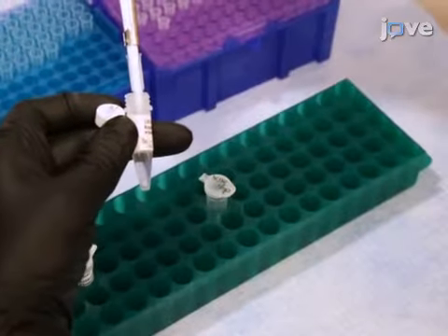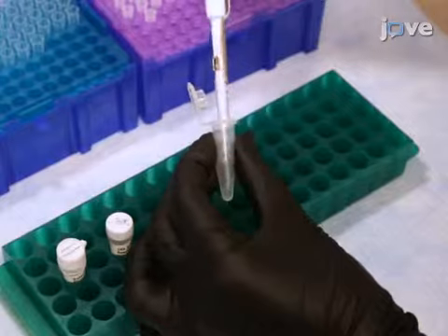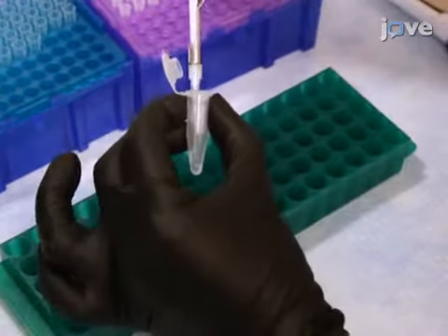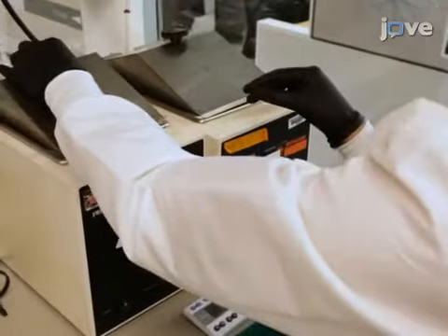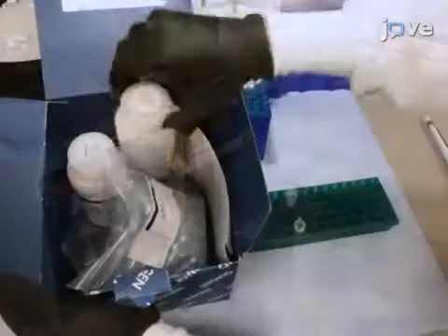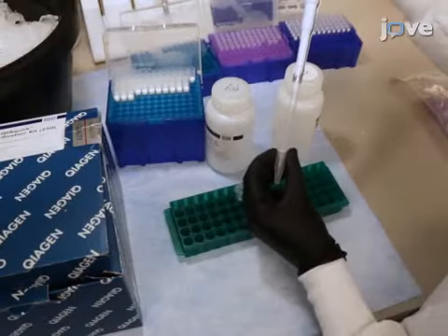To dephosphorylate the cut backbone, add 7 microliters of phosphatase reaction buffer and 2 microliters of phosphatase enzyme to the digested vector. Then, incubate the mixture at 37 degrees Celsius for 30 minutes. Purify the already cut and dephosphorylated backbone using a commercial kit.